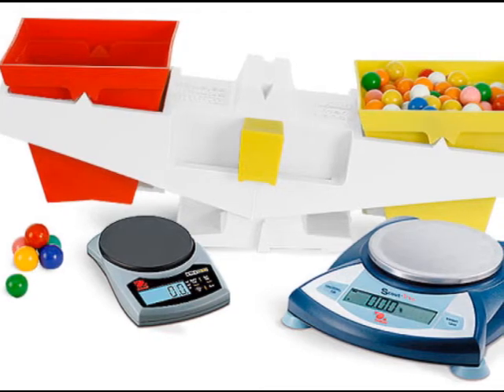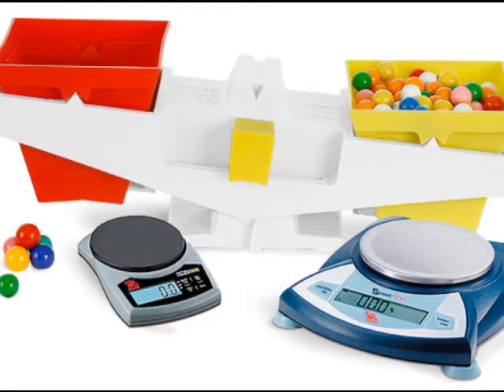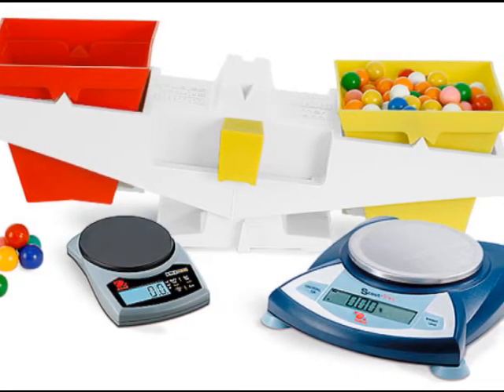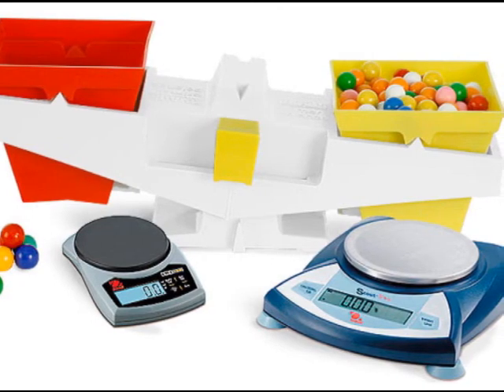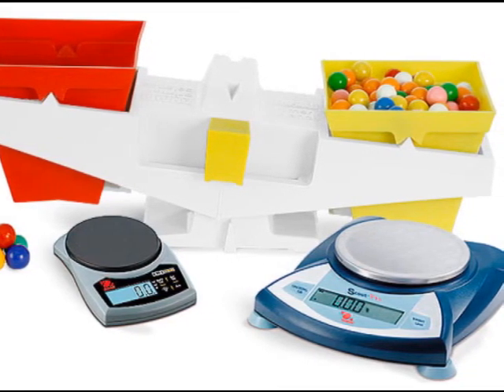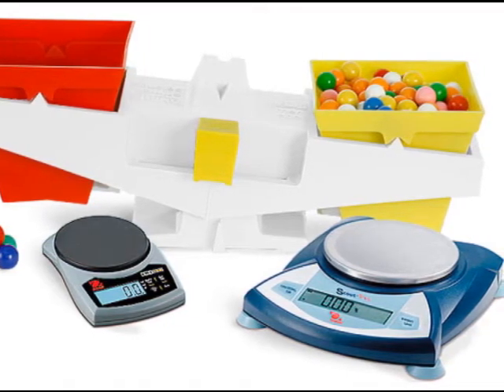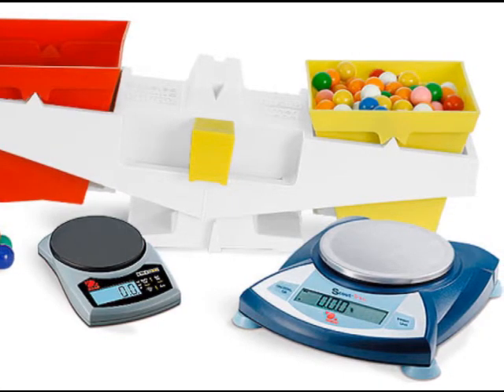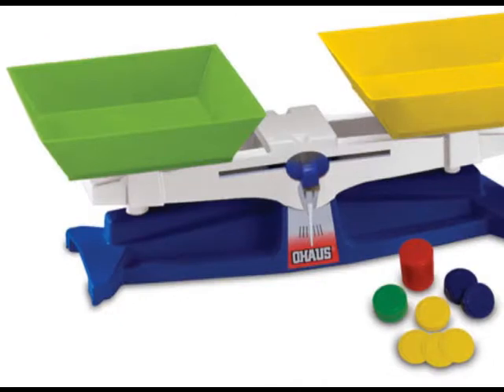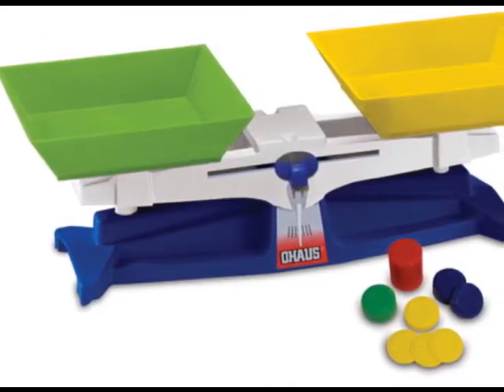The scales in this picture show you all the different things you might see in a science lab at your school. There might be a balanced scale, digital scales, or any of these scales you'll see in this picture. Notice in this balanced scale how there are two different containers and it's balanced on the needle in the middle. These types of scales are used to put things in each side and you can measure which one is heavier or lighter.